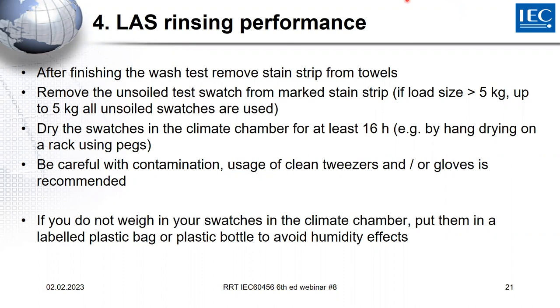All those steps here, you have to be very careful, because you're working in a washer lab, and you might use detergent there. If you don't have a clean environment, clean hands, clean other equipment, you might have cross contamination.